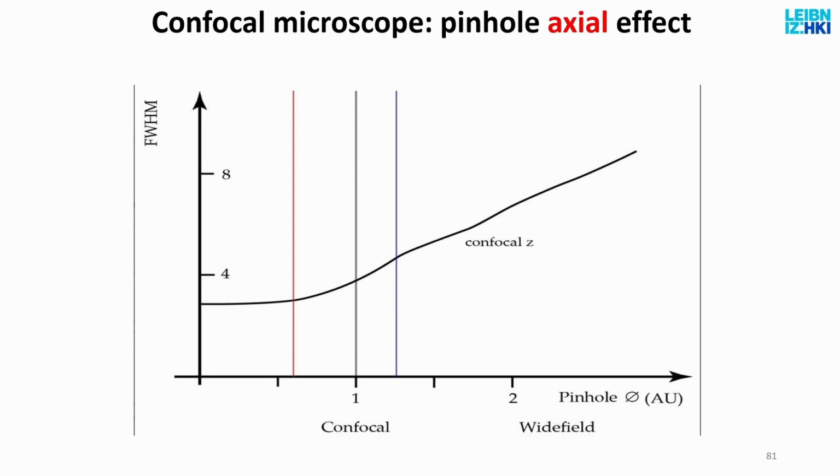It's actually a very interesting question, because what we have been receiving lately from research groups from the university is exactly a combination of confocal images and STED images. Because in STED microscopy the resolution is so high, and this is also a problem with single molecule localization microscopy techniques like STORM, that you may not see the actual structure. So let's say you are imaging actin fibers, and with super resolution microscopy you will see the structural details, the groups of molecules, but you may not see the whole fiber.